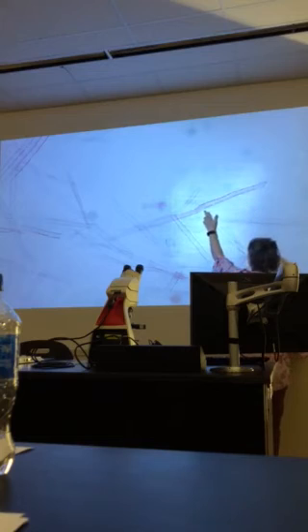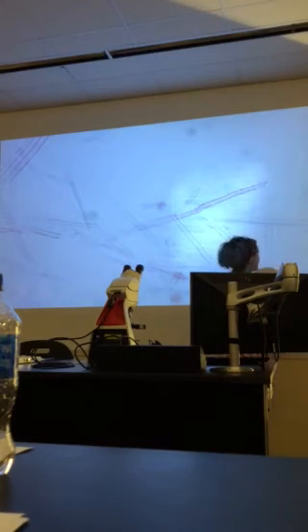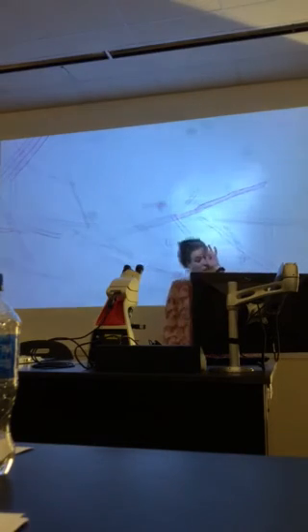They're much longer and narrower. They're all going to have openings to them, and unfortunately they're going to look very similar. But the ones that have large, big openings, those large pits, tracheids with pits. Okay? So this is Pinus australis. Those are tracheids with pits. Okay? That's what they are.